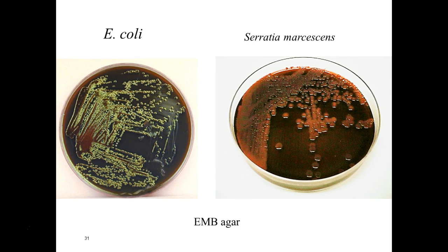So here's our EMBs. And as I said, the pictures don't do the real cultures justice, right? It's so much prettier in person. Are these mediums considered complex or defined? We'd have to look at their individual formulas to know that answer. So he asked, is it complex or defined. And I think most of these are complex.